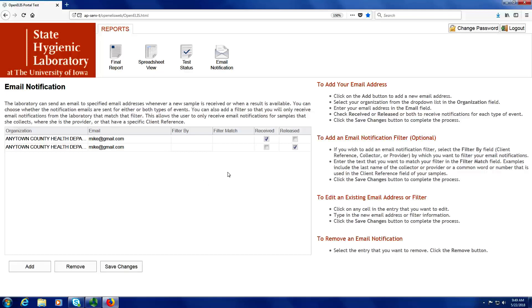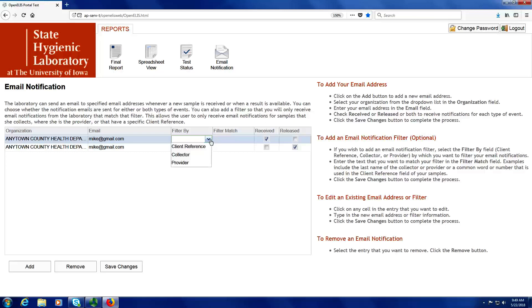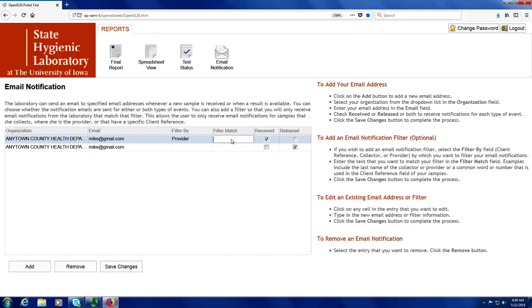This is all you need to do for most organizations. For some larger organizations, you can also filter the emails by clicking in the filter by column and selecting what you want to filter by. You can filter by the client reference, the collector of the sample, or the medical provider. I'm going to filter my clinical samples by medical provider — I select that, then type the name of the provider, and make sure I save my changes.